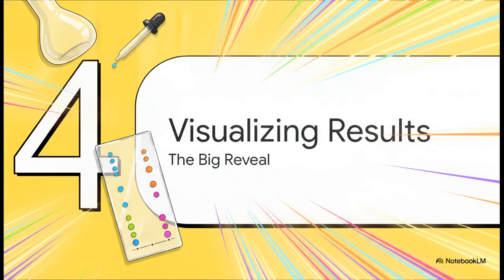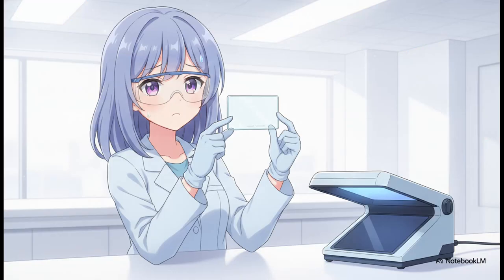All right, the race is over, the plate is completely dry, and that brings us to Section 4, visualizing the results, the big reveal. So, you're holding your dried TLC plate, and it looks entirely blank. Aside from your pencil lines, you literally can't see a thing. This is a massive problem because most organic compounds are completely invisible to the naked eye.